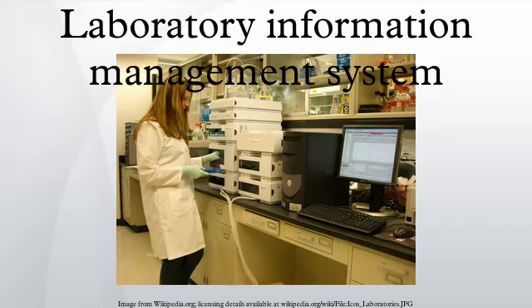Instrument and application integration. Modern LIMS offer an increasing amount of integration with laboratory instruments and applications. A LIMS may create control files that are fed into the instrument and direct its operation on some physical items such as a sample tube or sample plate. The LIMS may then import instrument results files to extract data for quality control assessment of the operation on the sample. Access to the instrument data can sometimes be regulated based on chain of custody assignments or other security features if need be.